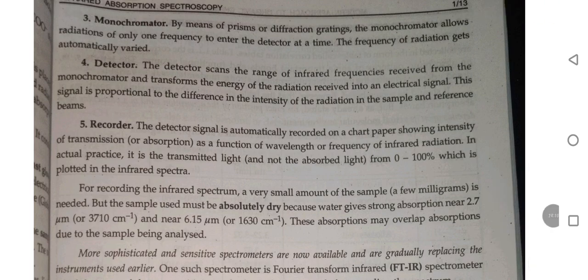Detector. The detector scans the range of infrared frequency received from the monochromator and transforms the energy of the radiation received into an electrical signal. This signal is proportional to the difference in the intensity of radiation in the sample and reference beam.